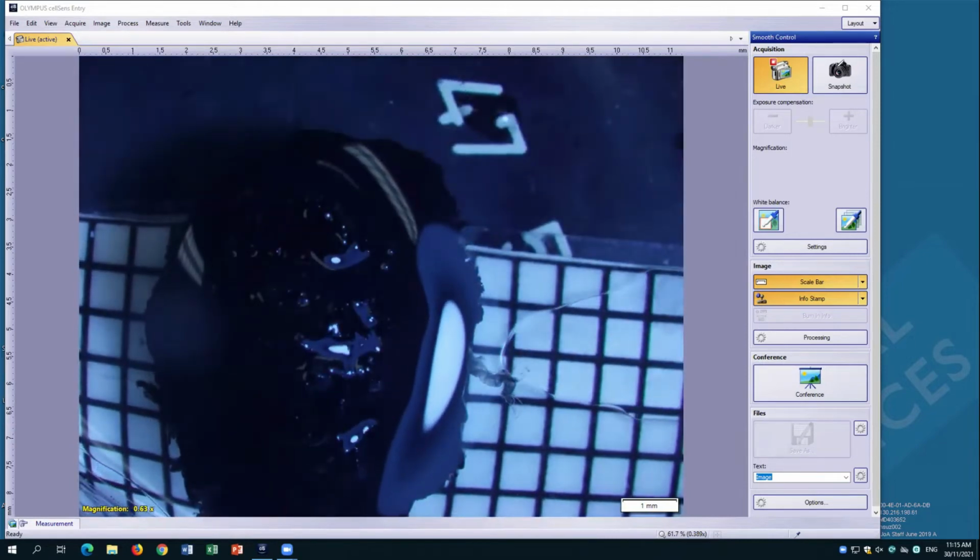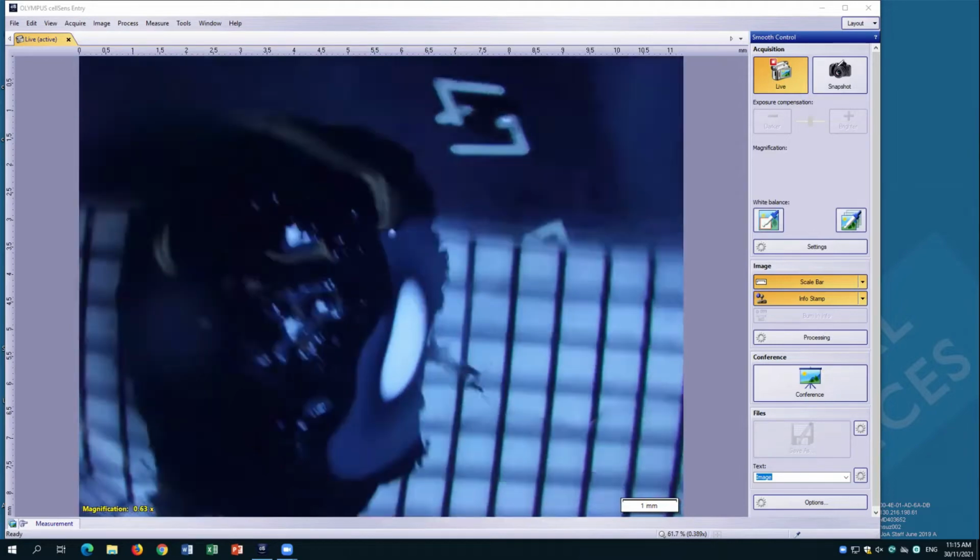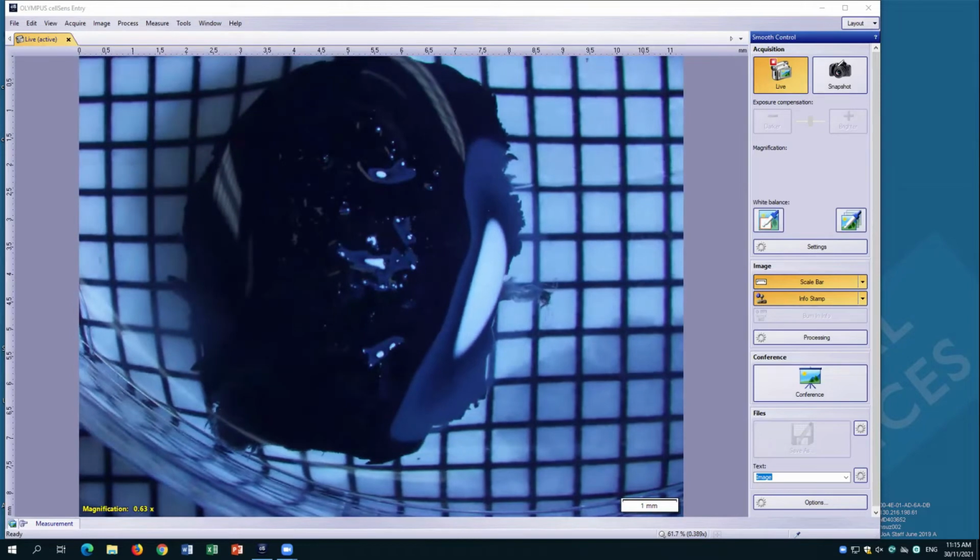And so this is a sample that's probably generated the data that I've just shown you as an example for micro CT, and we have something that Kahi's got. Now it's completely black because it's been stained with a molecule called osmium, and osmium enhances the contrast of X-ray. Otherwise, if you don't stain it, not much X-ray actually gets bounced around by the bone and the soft tissue. So soft tissue becomes almost invisible.